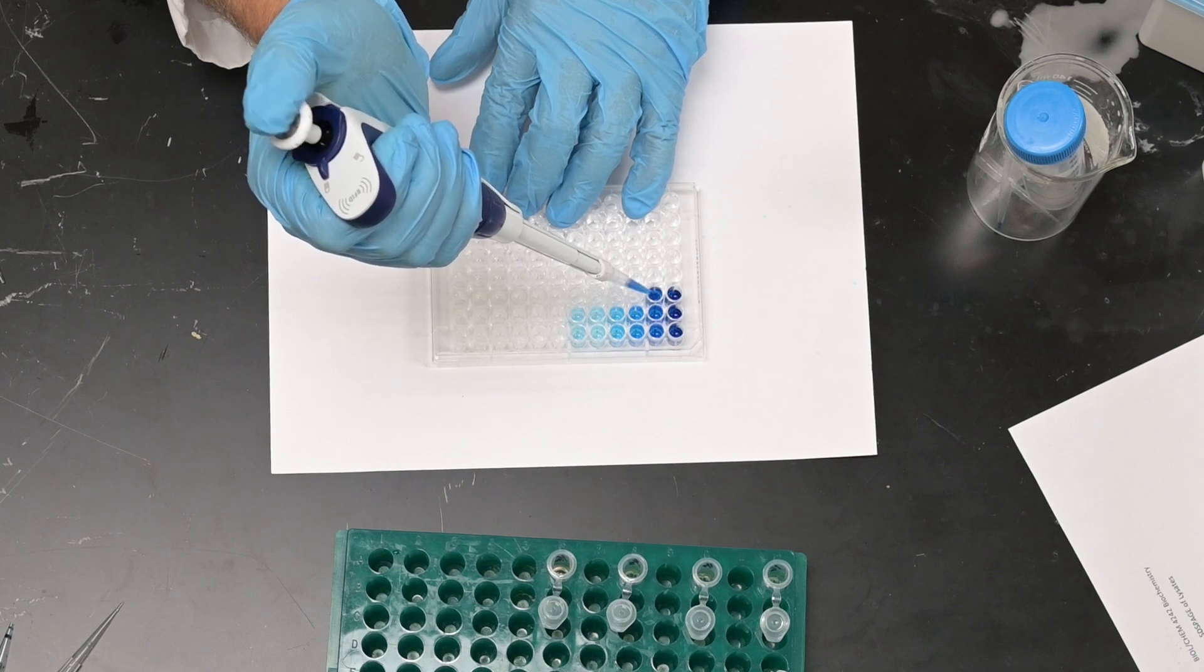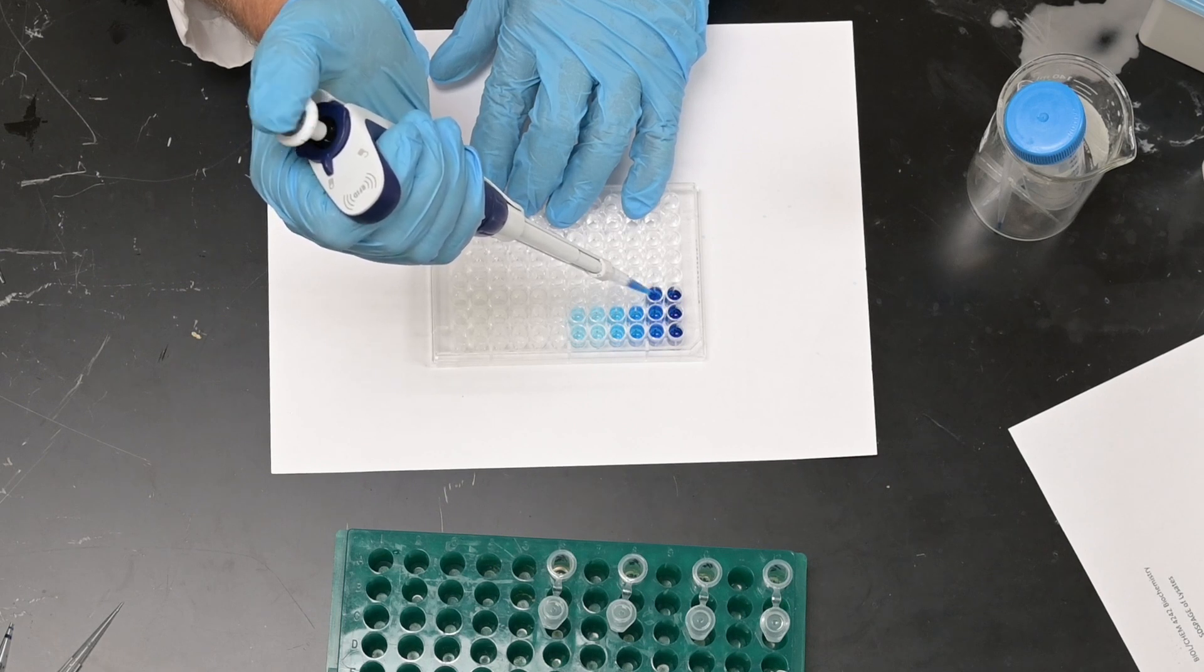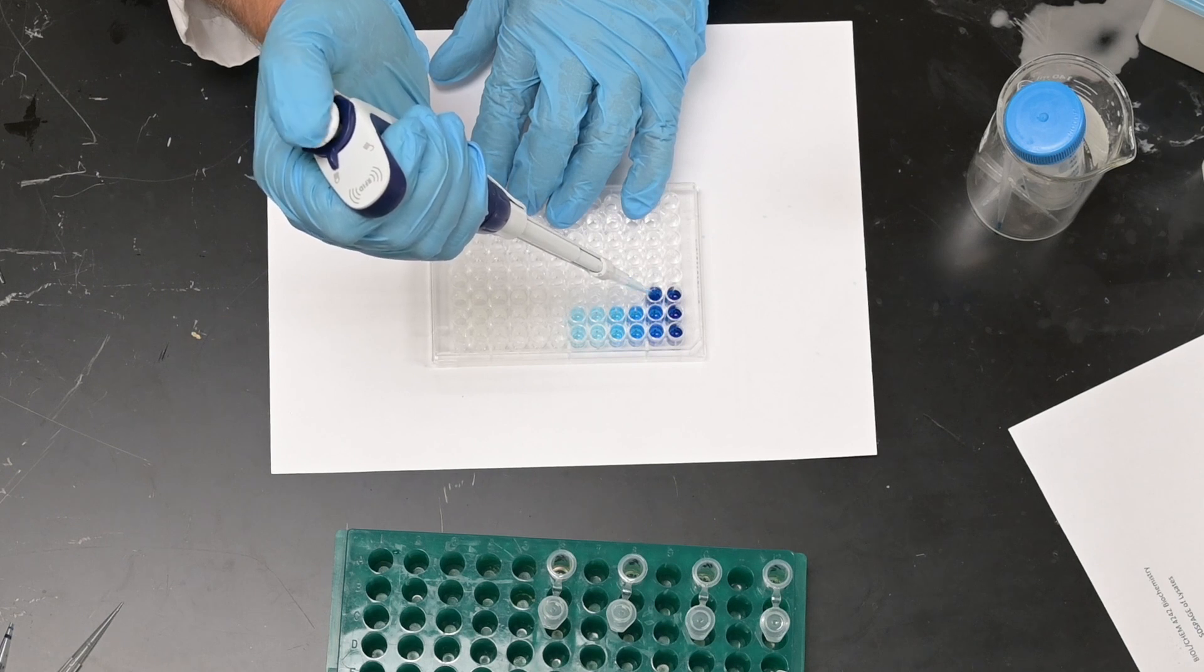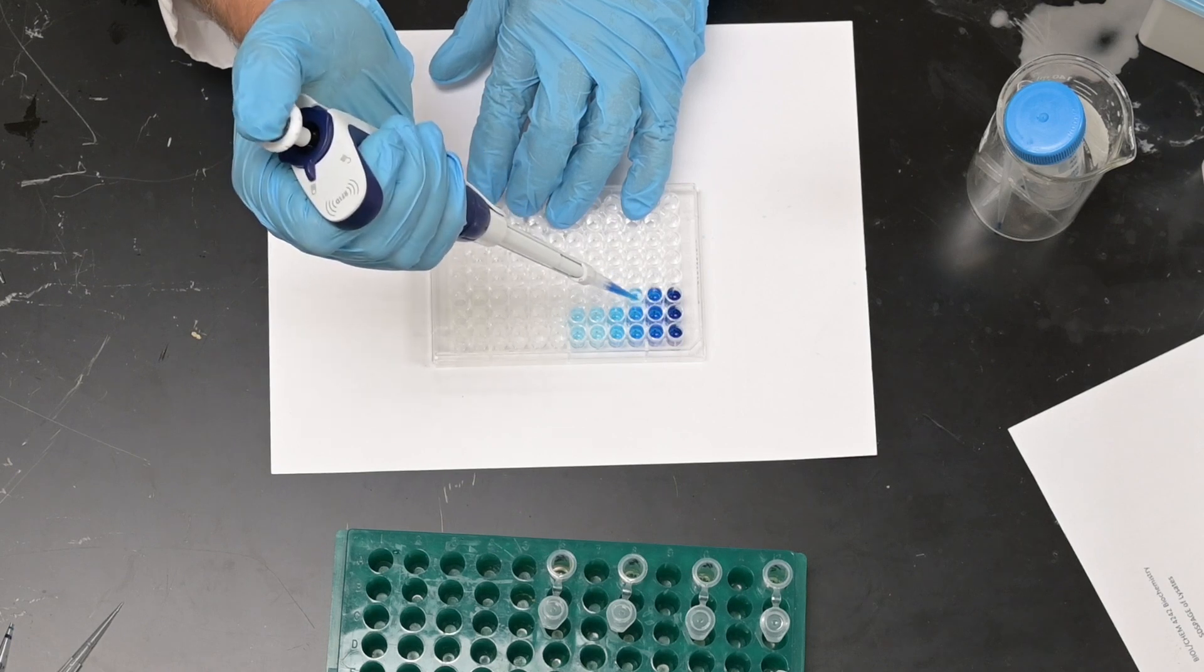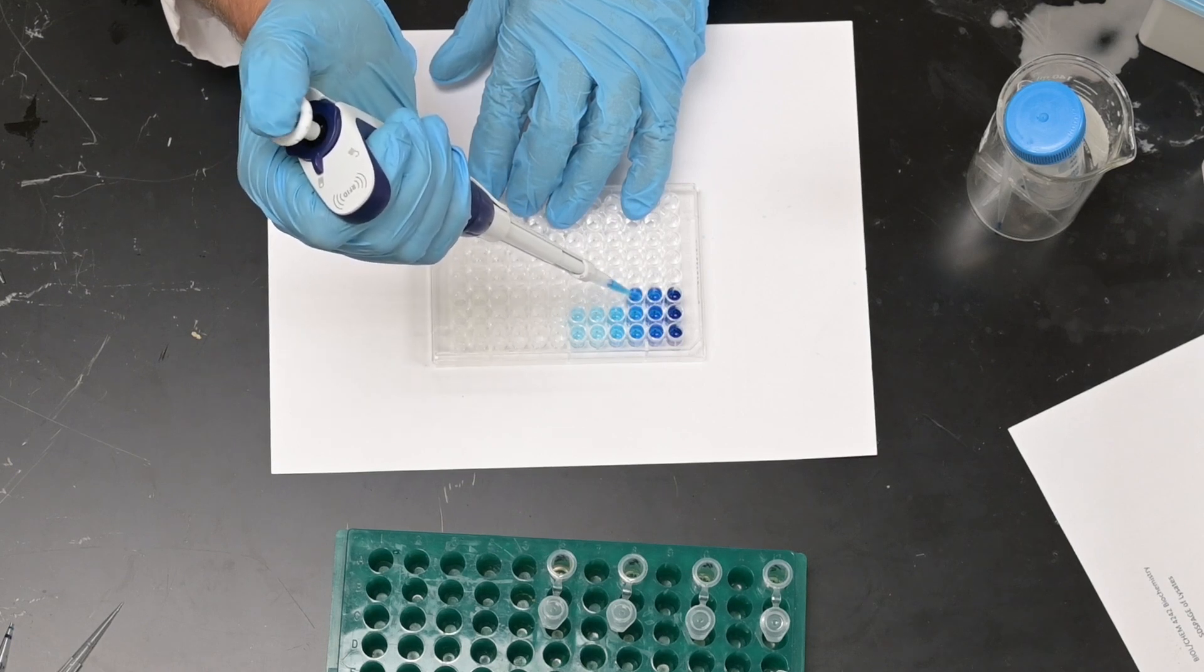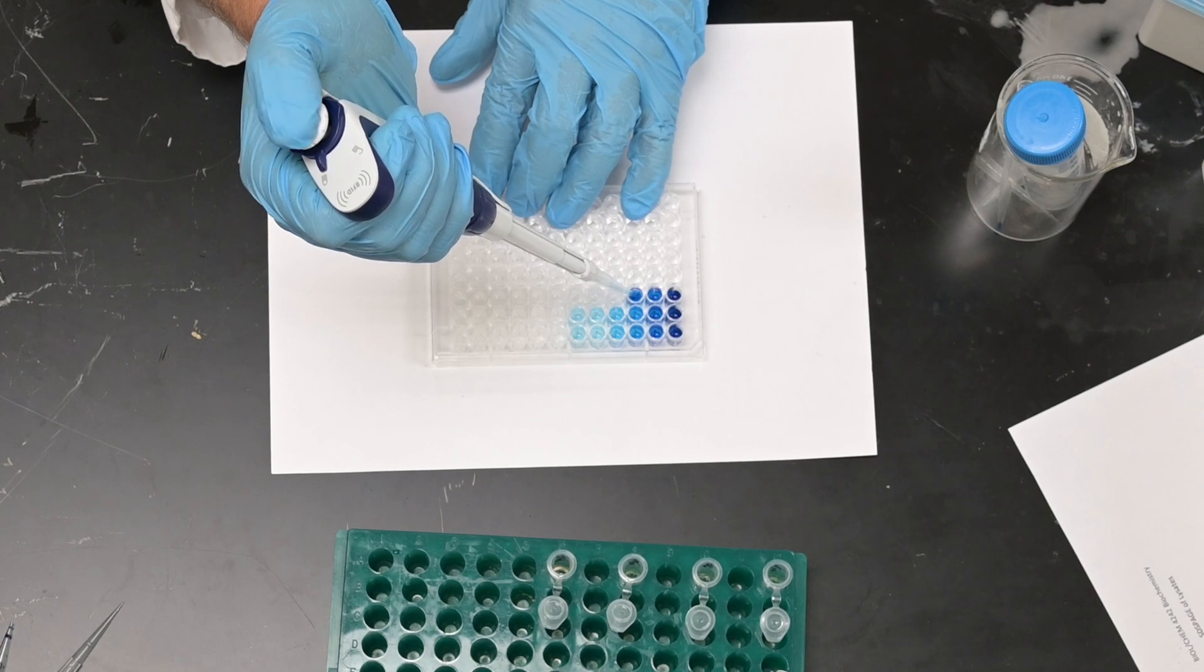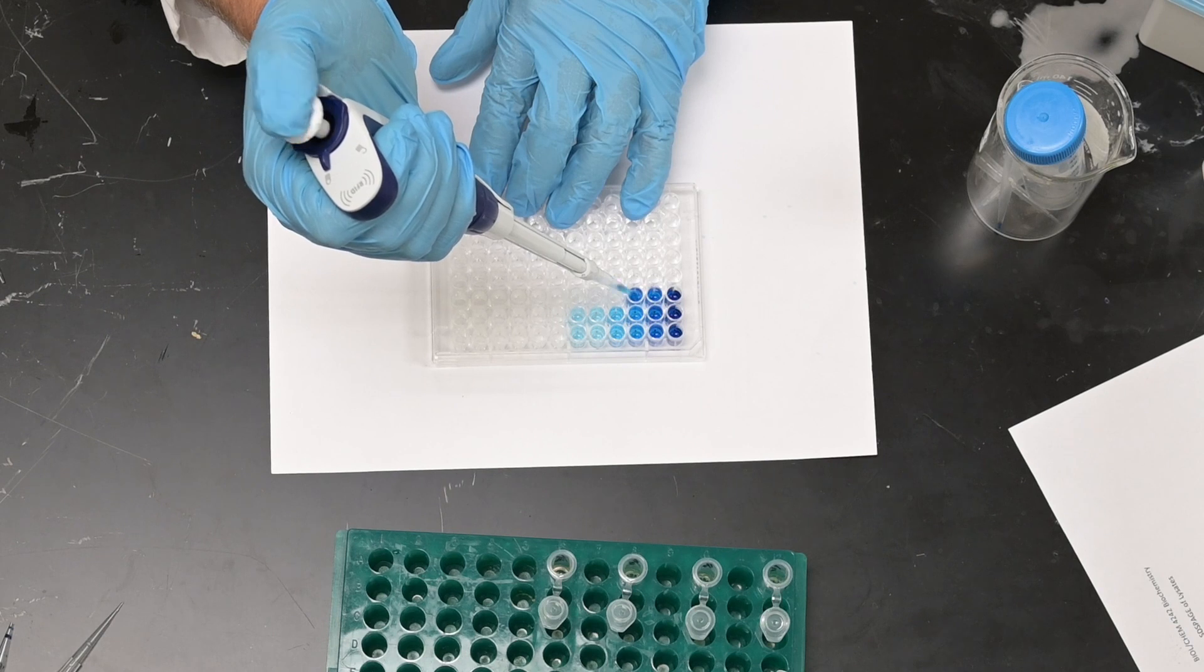Notice that as I'm doing this, I'm not changing pipette tips between wells because what I'm doing by mixing is I'm actually adding the next sample into the pipette and there's no contamination. All the residual liquid will be exactly the same concentration because I'm mixing it in the tip.